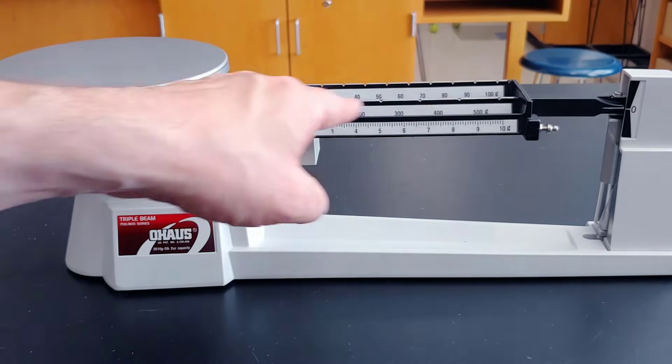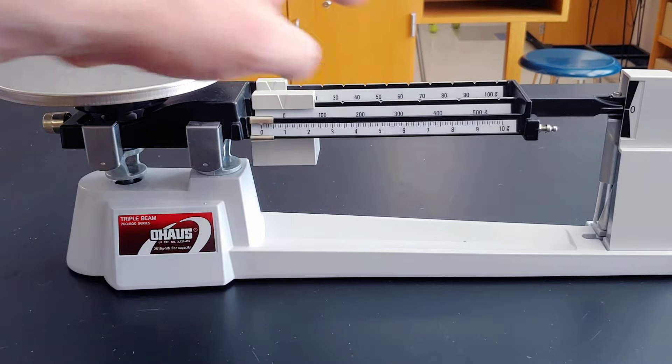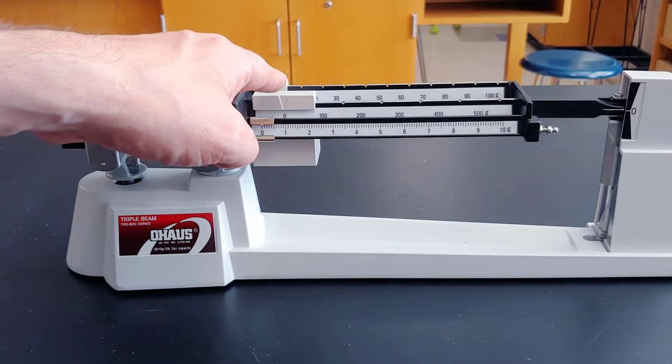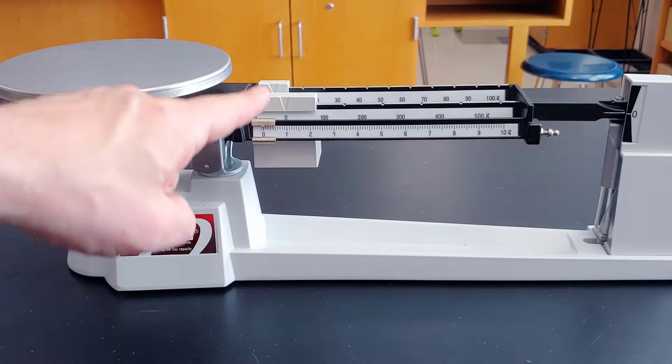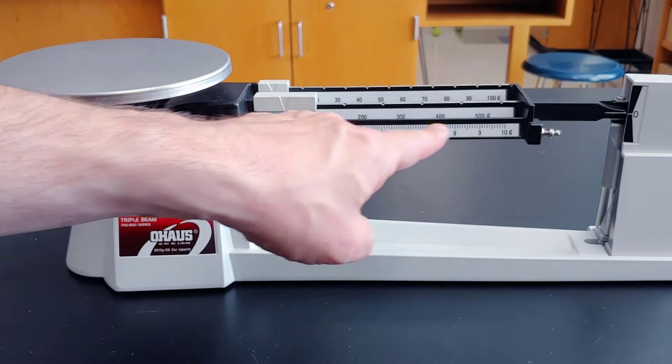These are the arms. You'll notice there are three arms. The one with the biggest weight is in the middle, the next smallest in the back, and the smallest are in the front.